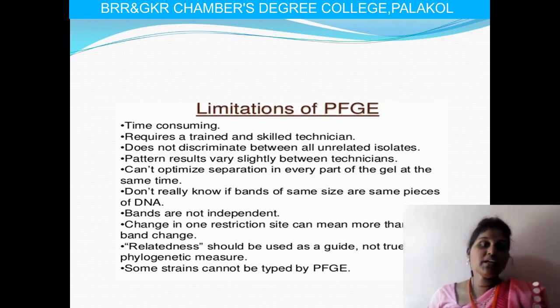Some strains cannot be typed by PFGE. If we take a group of bacteria, we can observe only some strains of bacteria; we will not completely study all the strains in PFGE. It also requires a trained, skillful technician. The person using PFGE should be skilled, otherwise the result will not be completely purified.